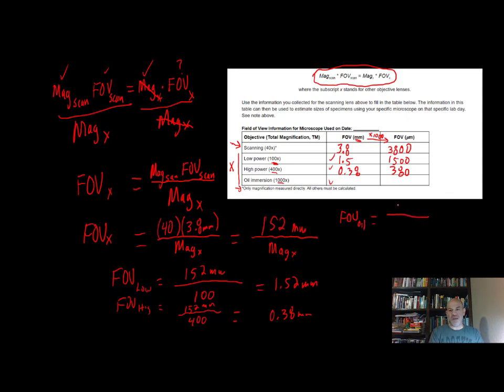And again, it's 152 on the top. And then I'm going to divide by 1,000 this time, and I'm going to get 0.15 millimeters. And then that comes out to 150 micrometers.